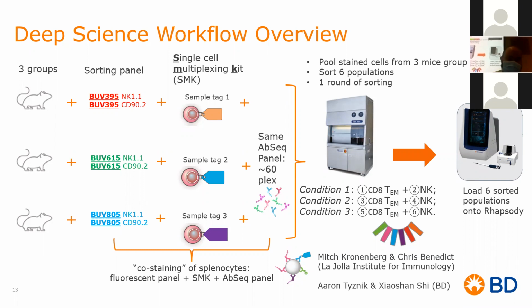third subset. Pardon, it just skipped my mind. But we had 3 subsets. That's the reason why we get those 3 name tags. So that way we don't have to struggle when we're doing the analysis about what's what. And we could incorporate everything in one cassette. And then we just separate it based on SMKs or use it as part of our analysis.